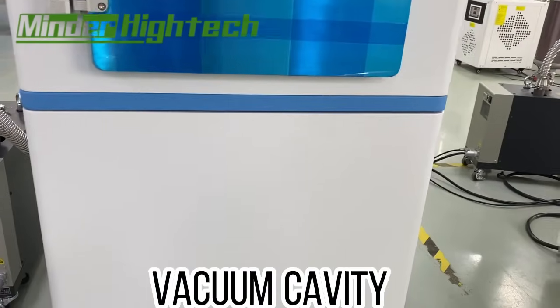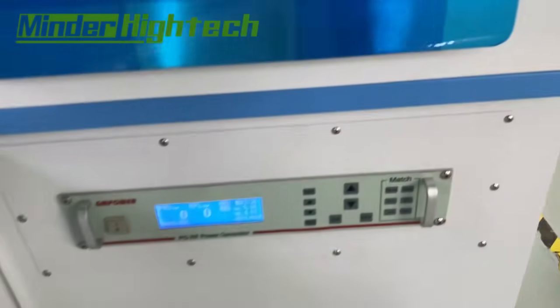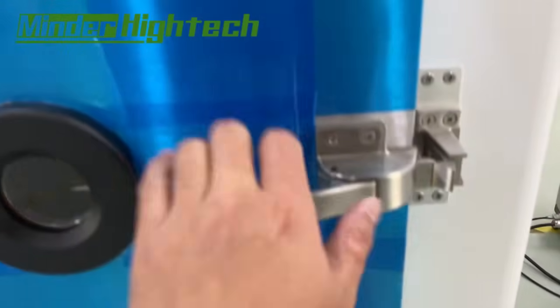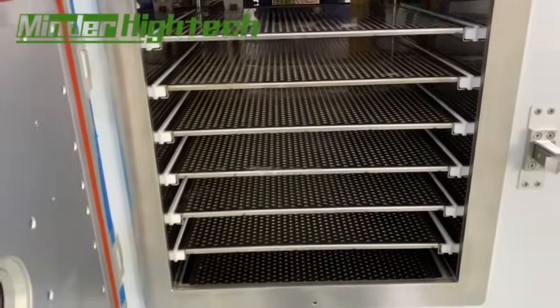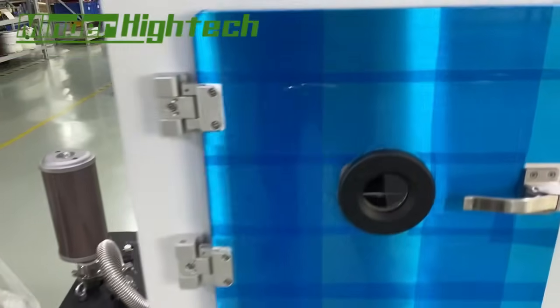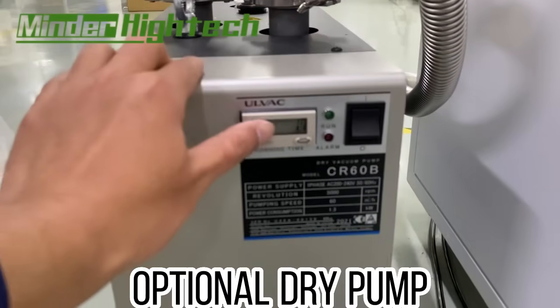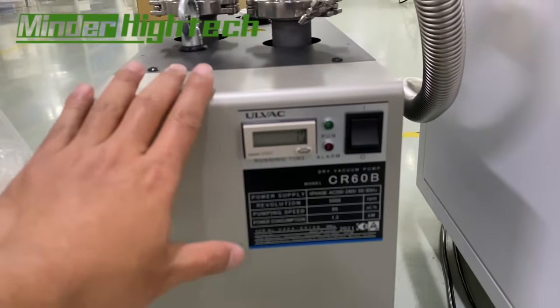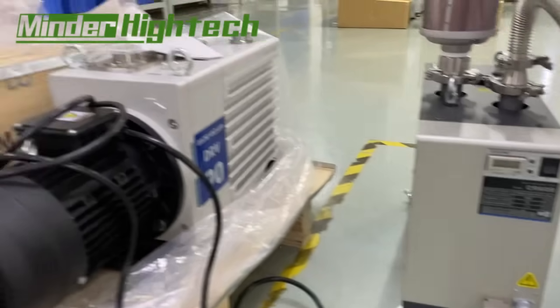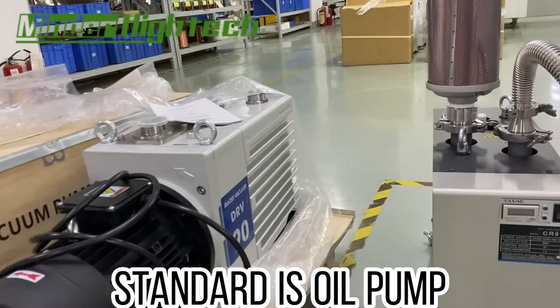Here is the vacuum cavity. Here is the power supply. This is a dry pump — it is optional. And this is a very standard oil pump.